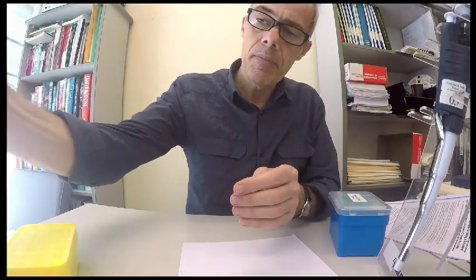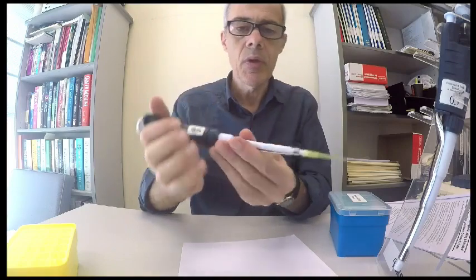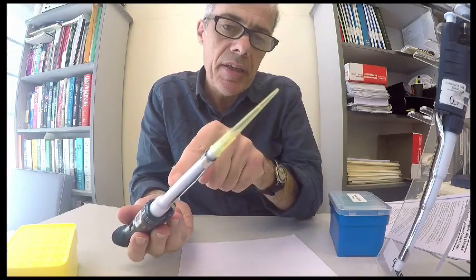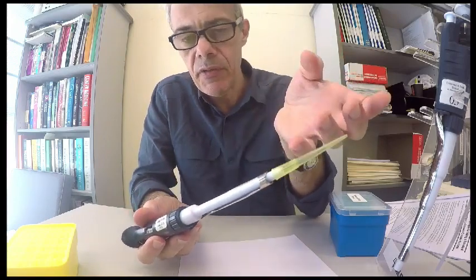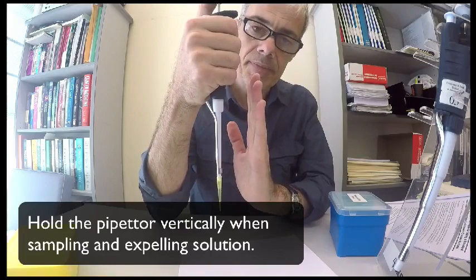When you're working with these pipettes, just imagine you've just drawn up a solution, you have a wet solution in here. If you hold it at an angle like that, the solution is going to run down the barrel into the machine, and that's going to damage it, and you're going to have to clean out the machine, and it's a lot of time and effort. So when you have a solution in here, you keep it in the vertical orientation.